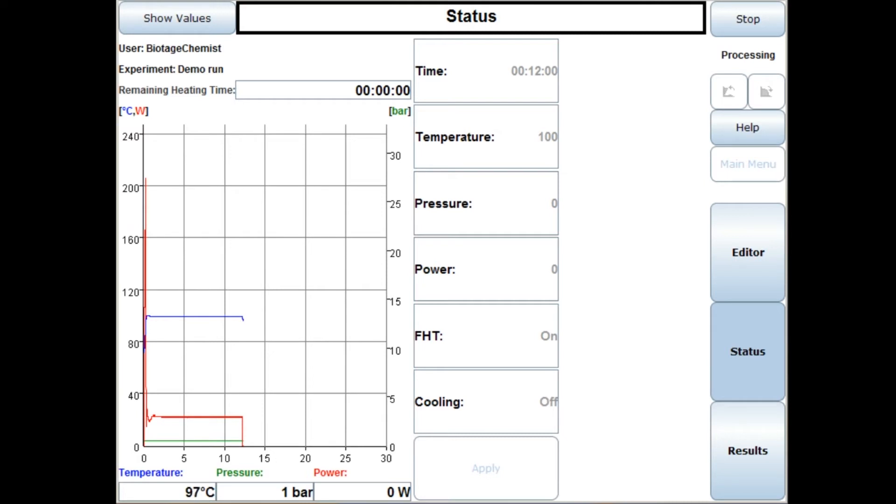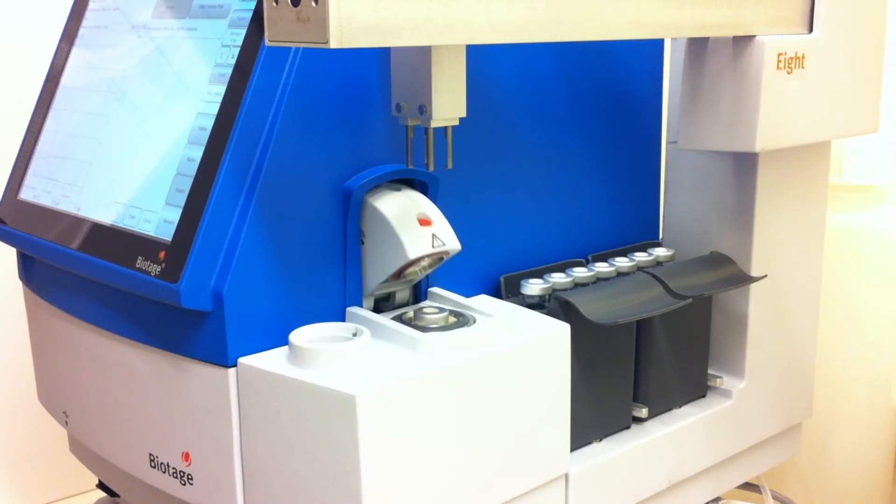There we go, the reaction is finished, the cooling has begun, and as soon as the temperature gets below 50 degrees the lid will open and allow you to access the vial.